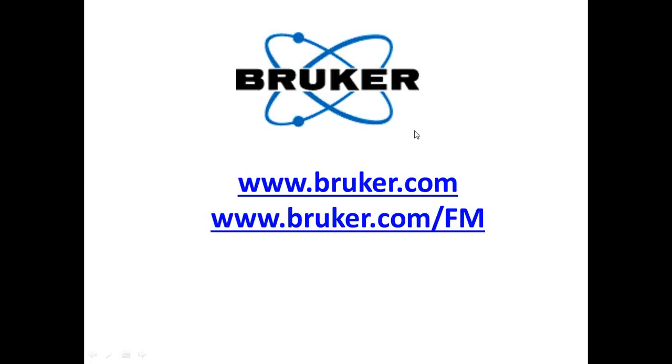Really good blocking, choosing the right blocking, like BSA or goat serum, helps. And what we found was if you're using glutaraldehyde fix, there's some types of background that can be quenched using either glycine or sodium borohydride. I've employed all those techniques to minimize the background that I'm getting from whatever biological structure I'm imaging.